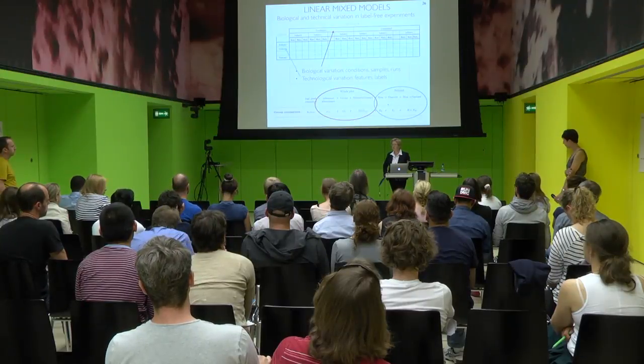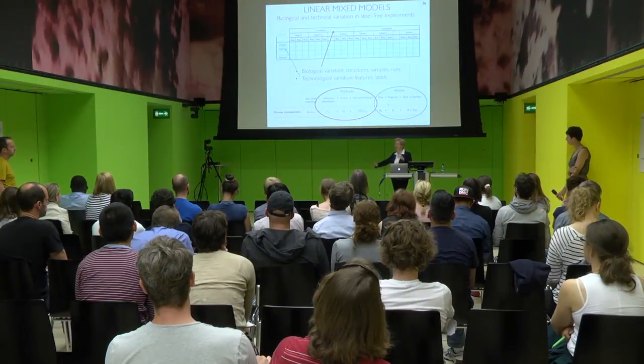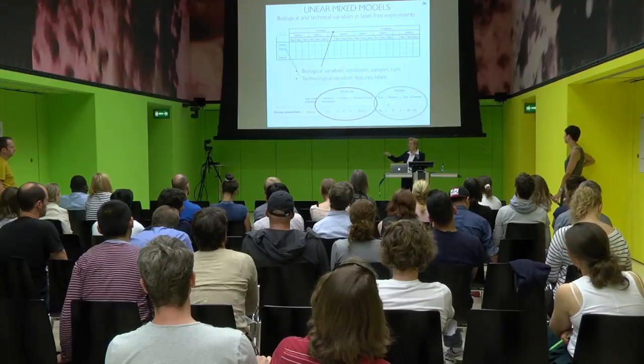So a simple way would be to just have the lowest value for this feature across runs, the lowest value for the run across all the features, or if you have access to the signal processing tool, integrate the noise in the area and just use the noise integration as the value, right? So these will be simple ways. And frankly, that's what I would go with. I wouldn't do anything more complicated.